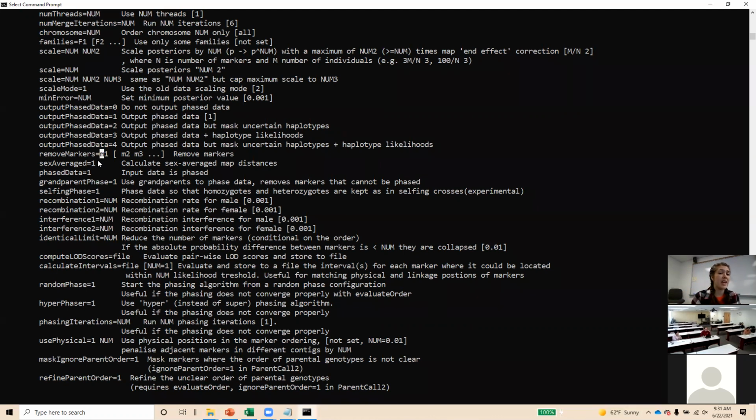If you set it as 0, that's how it'll show up. Maybe if I draw this out, if you plotted out the centimorgans versus the physical position in base pairs, what you would expect is the physical positions to align fairly linearly with the centimorgan or map positions. So if you have it like this map, I'll do it not backwards.